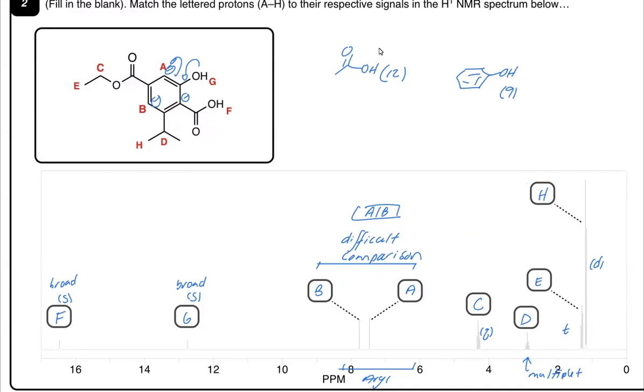Big takeaway from this, carboxyl proton should be more downfield compared to phenolic OHs. Okay, and remember those two chemical shifts were fairly predictable because we had sp2 oxygens. If you had an alcohol just having an sp3 oxygen, chemical shift is a lot more variable, 2 to 7, and that's also where you'd see sp3 nitrogens bonded to protons as well. There's an overlap there.